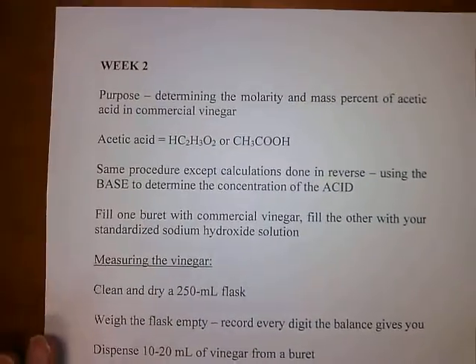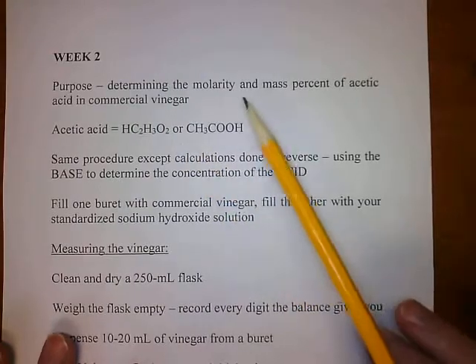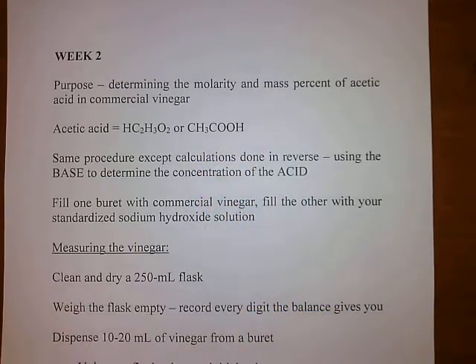So what about week 2? Week 2 is where we actually titrate the vinegar. So you'll determine the molarity and the mass percent of acetic acid in the commercial vinegar.